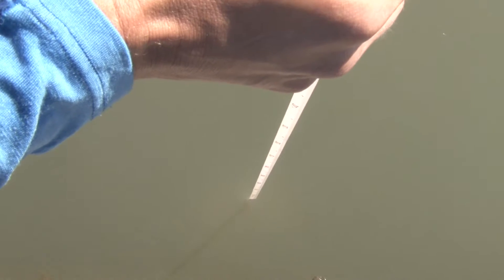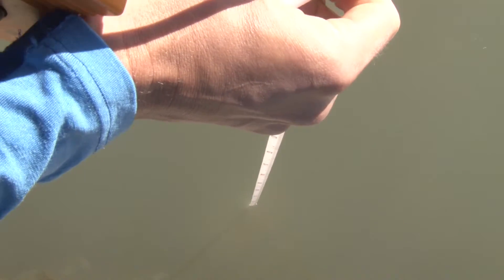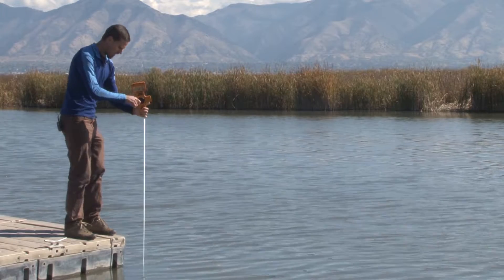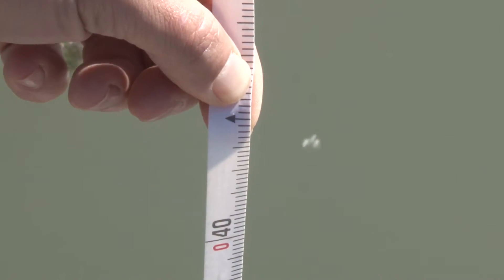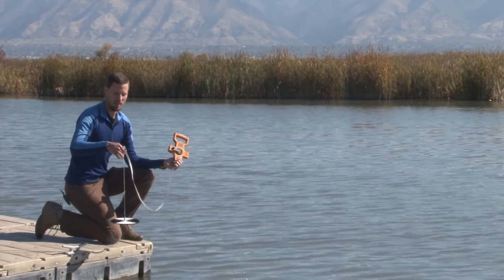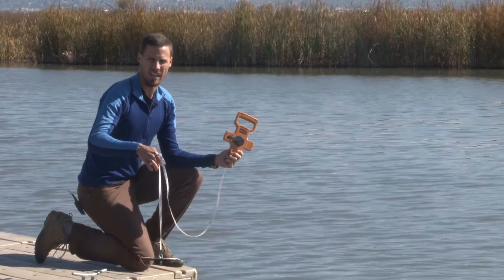Then you slowly move it back up until you can just start to faintly see it. As soon as you can faintly see that white and black outline, you mark the surface of the water and measure how deep down the disk is. That gives you a good measurement of the water clarity in the column of the lake or reservoir.